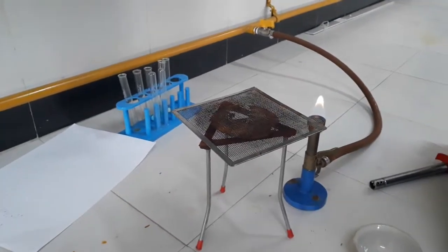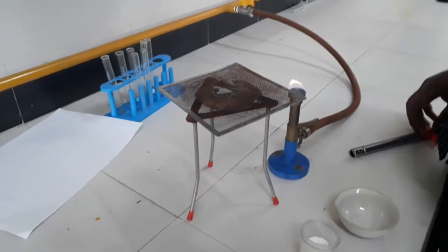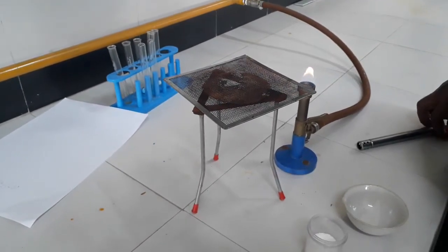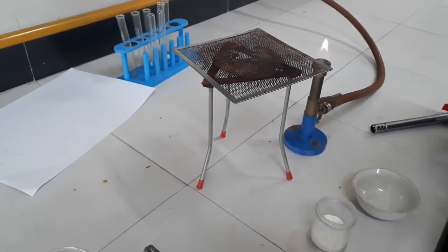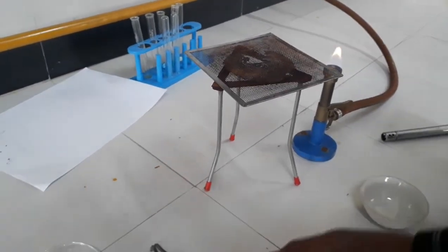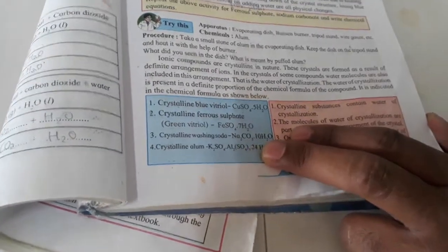Good morning students, we have discussed water of crystallization in the previous video. Today we will see water of crystallization of alum. The alum formula is given in your textbook. Here you can see it is K2SO4.Al2(SO4)3.24H2O.